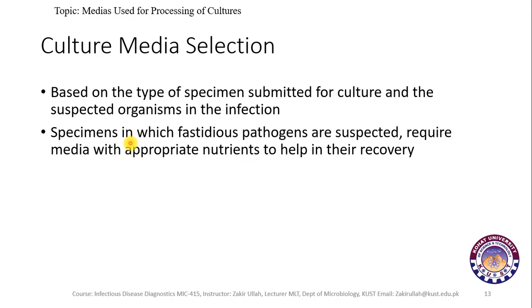In samples where fastidious pathogens are suspected, specific nutrients or enhancers must be added to the media to support their recovery, so that these samples do not go in vain.